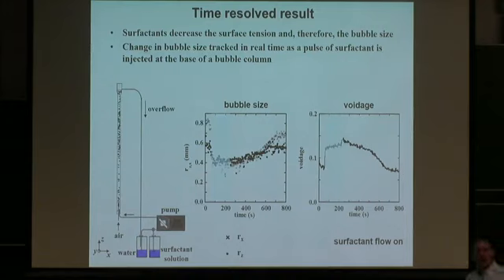And one of the things I wanted to highlight about this is, obviously this is a specific application, but it's also, compared to the other images that I've shown, on relatively high spec equipment. They're sort of superconducting magnets, fast switching gradients and so on. This actually, just by thinking about a few data points that we might need to acquire, is a very simple type of data acquisition. So potentially you can move from a much more complicated research grade type experiment to a permanent magnet system which doesn't require cryogens at all, something that can be benchtop, even potentially handheld.